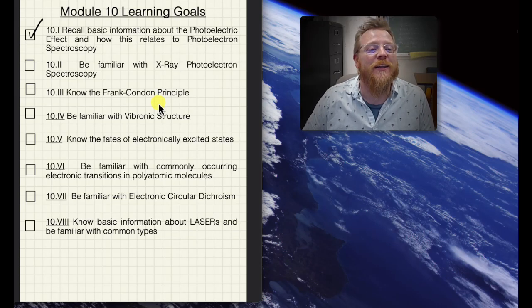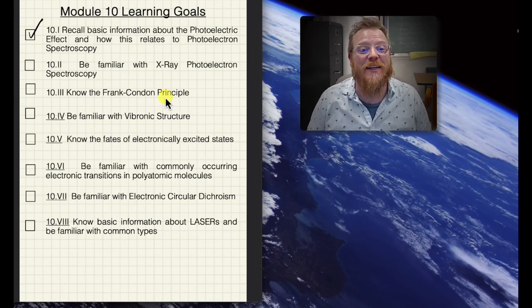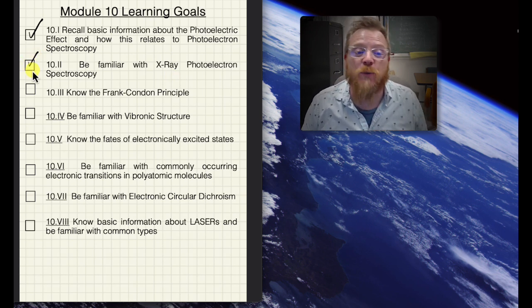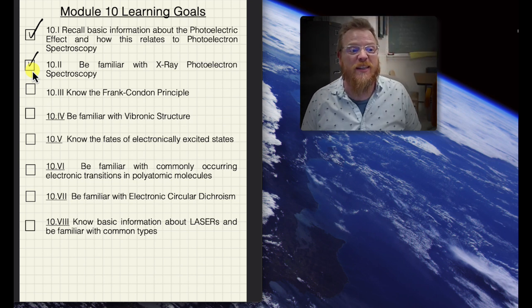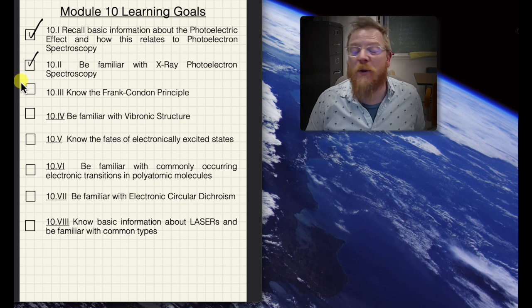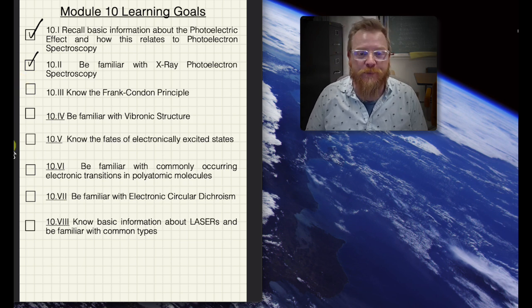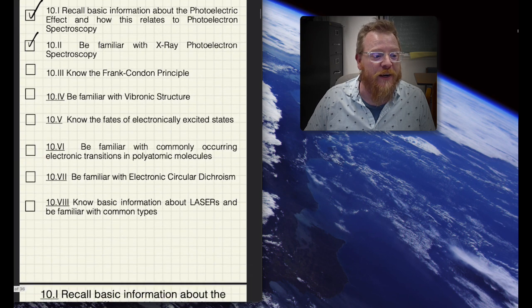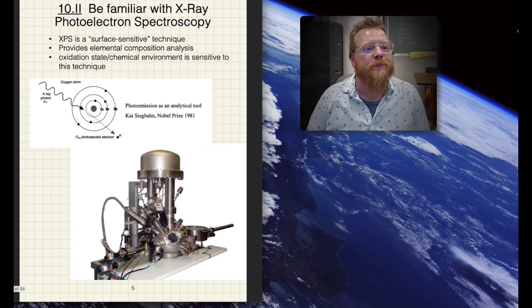Okay, folks, let's get into this XPS thing, X-Ray Photoelectron Spectroscopy. This is a really, really cool technique. As we'll see, the spectrometers for these things are enormous. They're expensive. That's why we don't have any here at Cal Poly Humboldt. But they are very common in material science characterization. So let's go for it.